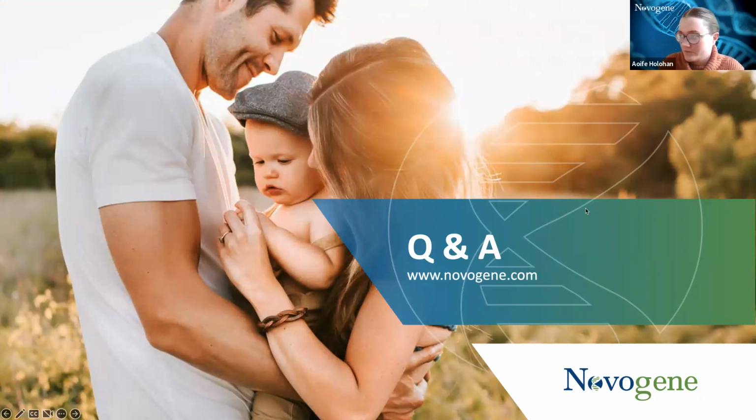So I'm going to start here with one from Irina asking about what about RNA transcriptomes without reference on NovoMagic? Okay. This is actually a very interesting question because I didn't really touch much on this part. And I think for this, we do have two solutions here.